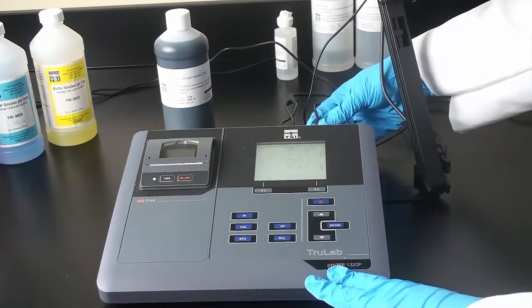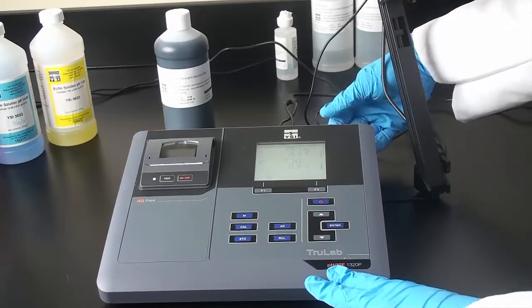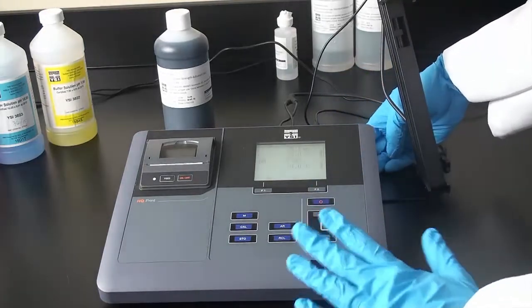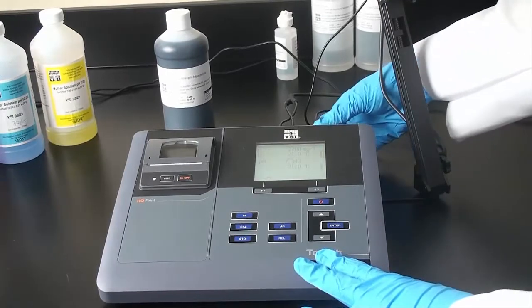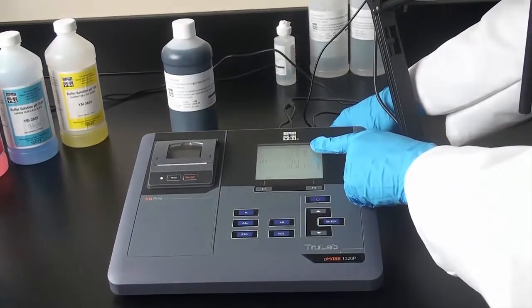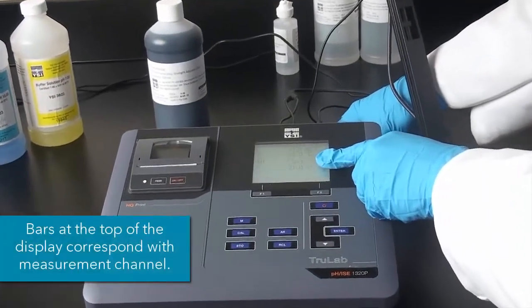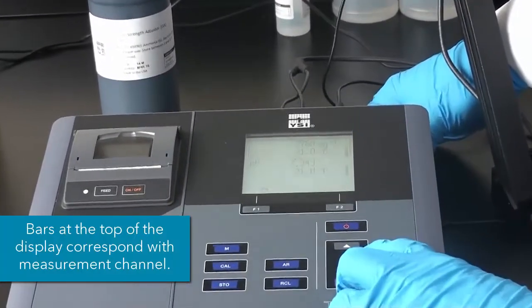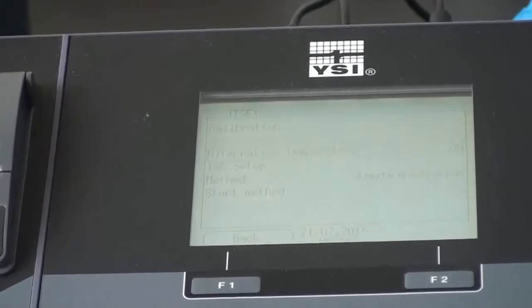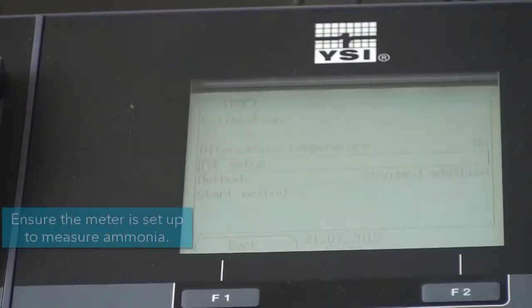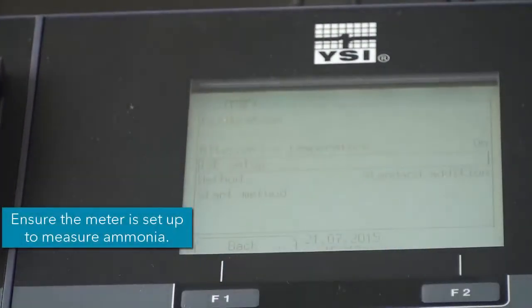But the first thing you'll do is connect it to the instrument, and then you'll want to go in and tell the instrument exactly what is connected to it. So as you can see here, I have an ISE and a pH electrode connected. So I will want to go in and set up this ISE to make sure that I am actually measuring ammonia and not calcium or any other ion, for example.